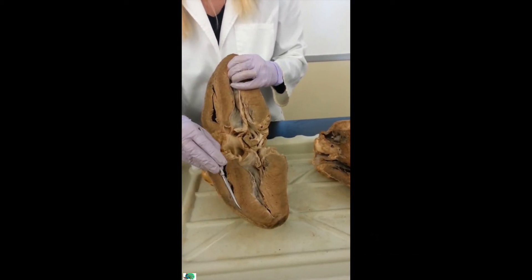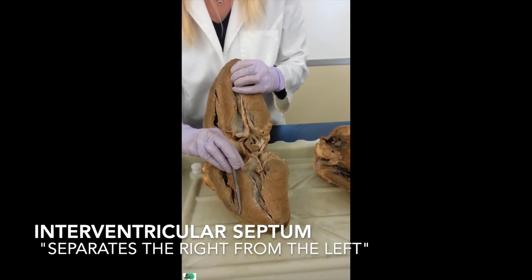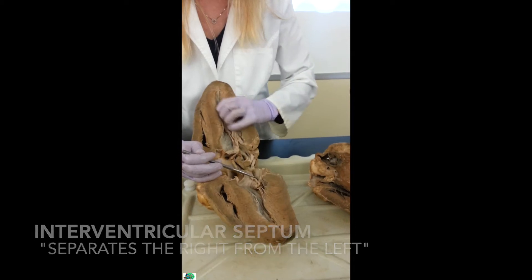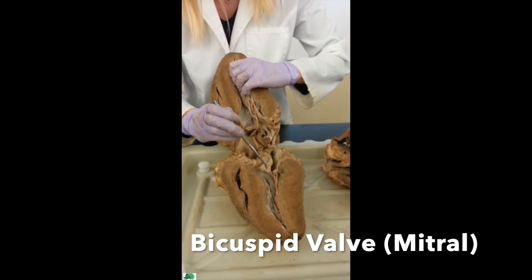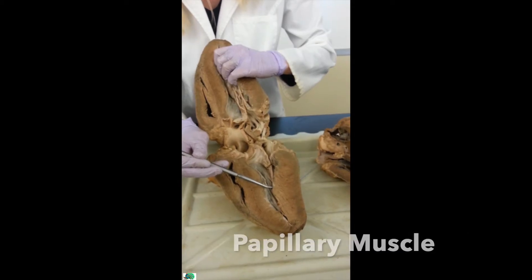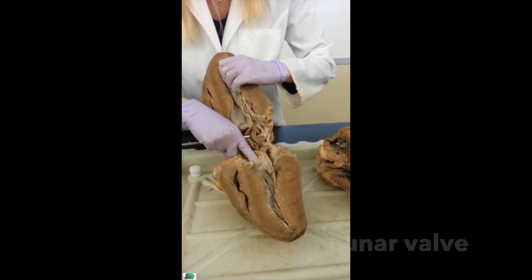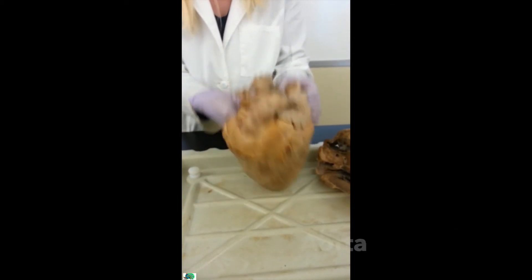This dark line right here is the interventricular septum, separating the right from the left. There's my apex again. Coming up here, here's my left atrium. Here's my bicuspid valve. Here's my chordae tendineae, attached to the papillary muscle right here. The blood goes from the left atrium, past the bicuspid, to the left ventricle, then pumps up through my aortic semilunar valve — it's a little flap — and goes to the aorta.